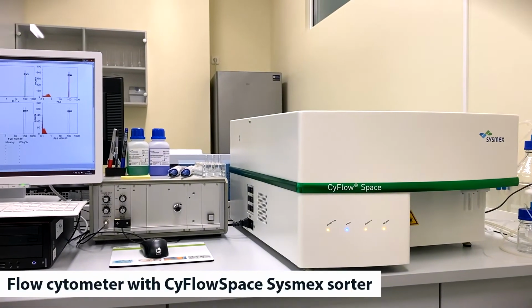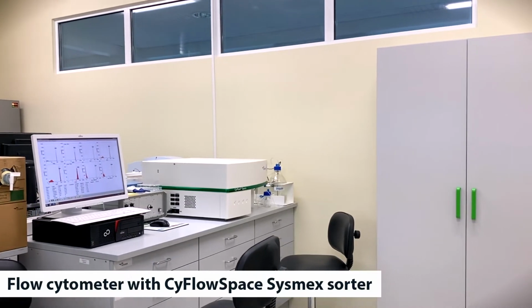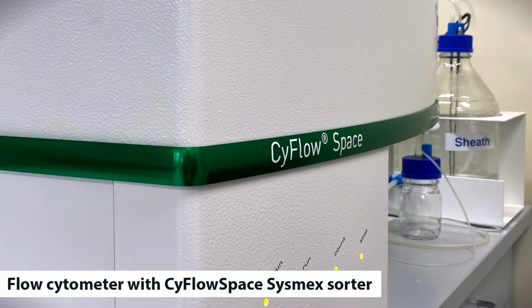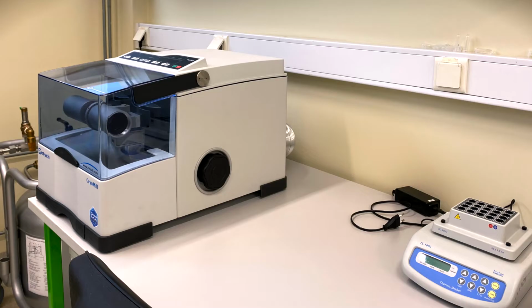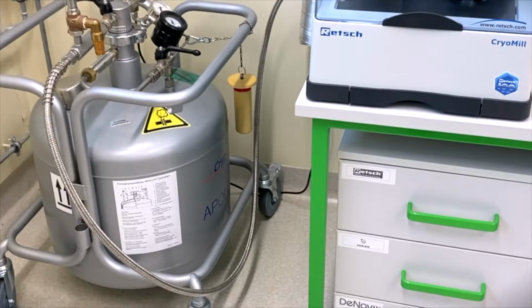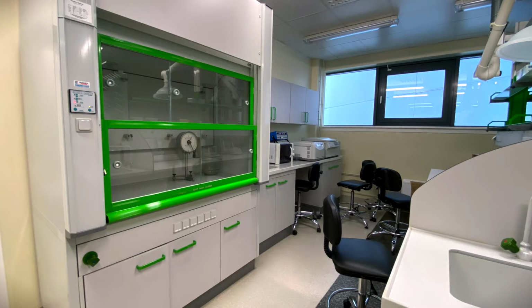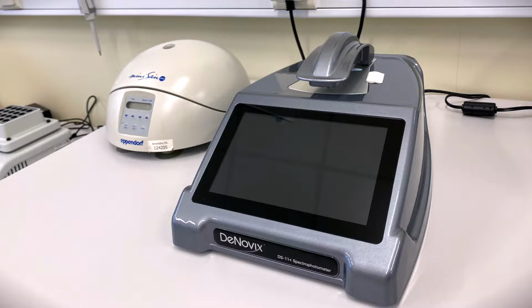Our flow cytometer not only analyzes cell changes based on fluorescence with the help of 3 lasers, but also allows non-invasive sorting of cells. After that, these cells can grow as individual cell populations. DNA fragments and RNA are isolated with the help of various centrifuges, including refrigerated centrifuges and ultracentrifuges. We can obtain DNA from various objects in a non-invasive way, from scales, from mucus, etc.